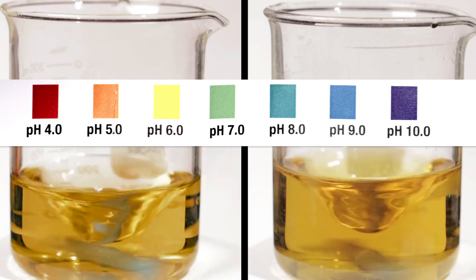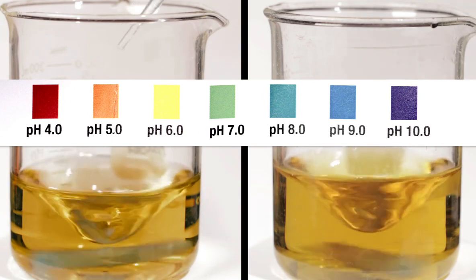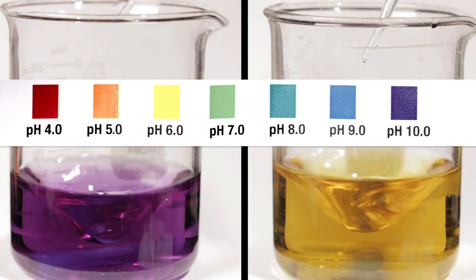Now, I'm going to add concentrated sodium hydroxide, which is a strong base, to each solution. It only took one drop of strong base to dramatically raise the pH of solution A. After one drop, the pH of solution B hasn't changed.